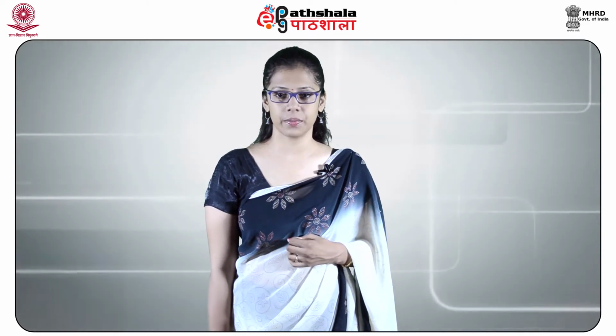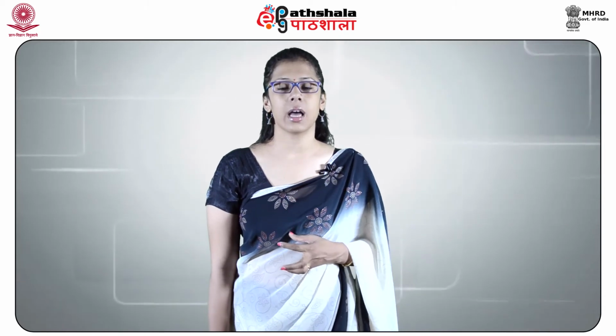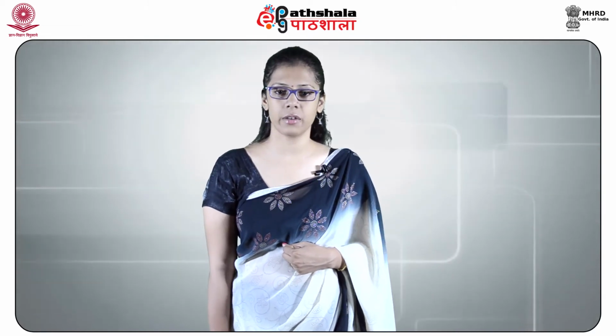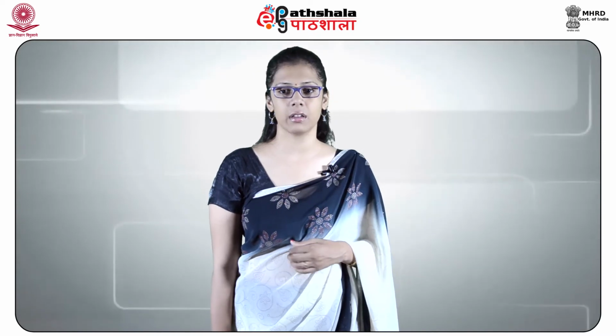A mercury lamp inside of the unit produces a high intensity UV, that is around 320 to 400 nanometer, and visible light, that is 400 to 700 nanometer, which was developed to detect biological stains even in daylight. At the end of the flexible light tube, a beam applicator is focused on a spot or spread to a fan-like triangle.